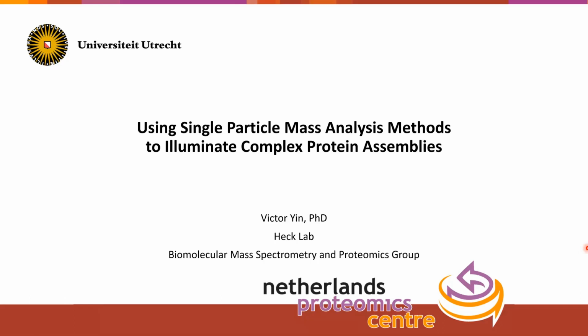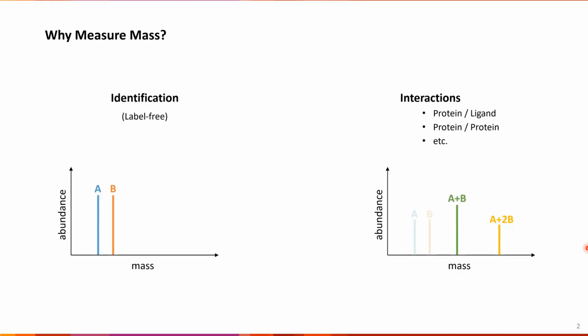Yeah, hi everyone. Thanks for the introduction, and thanks again to the organizers and Refine for helping to set this up. Today I'm excited to tell all of you a little bit about the work going on here in Utrecht, where we're using single particle mass methods to study these heterogeneous, complex protein assemblies that have historically been quite challenging. Before I dive into it, I think it's useful to first discuss why we would want to measure the mass of biomolecules.